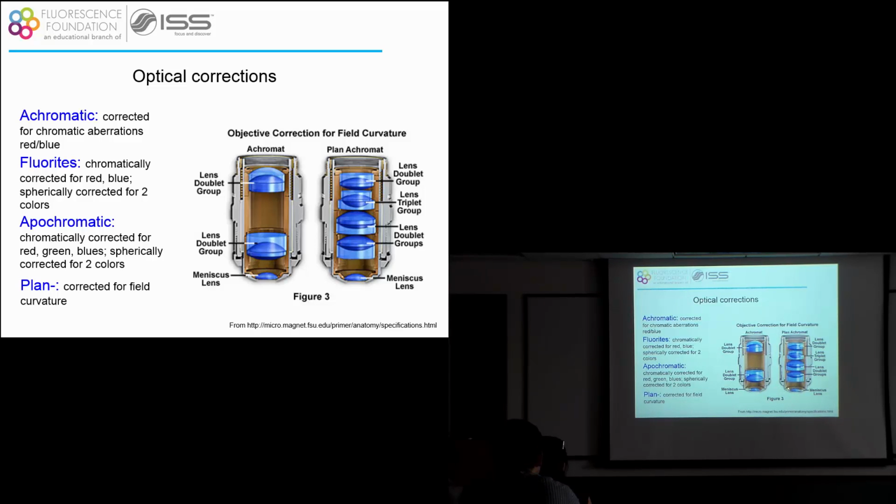As you can see, inside an objective, there are so many optical elements, so many lenses, and some of these lenses are glued together. So it's fairly complicated, which also translates into the price. So an objective that is oil immersion might cost $4,000. A water immersion 60 times, it might cost $10,000. They are actually coming out with objectives to study tissues now at depth, and they are projecting the cost at about $20,000, $25,000. So overall, the microscope is not a cheap instrument.